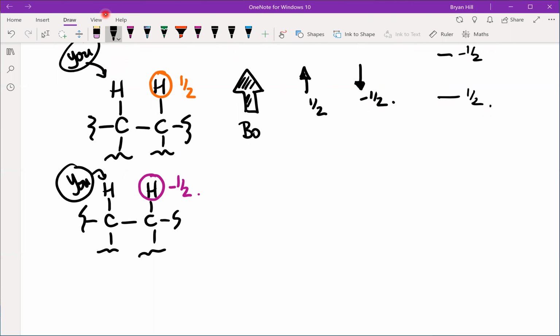Now the NMR technician is using a continuous wave spectrometer, sweeping the frequencies and causing all of the protons to resonate, right? We'll call this reality A, and we'll call this reality B.